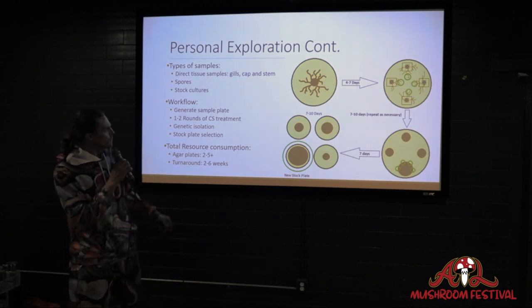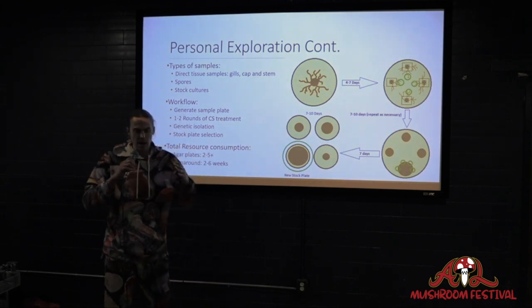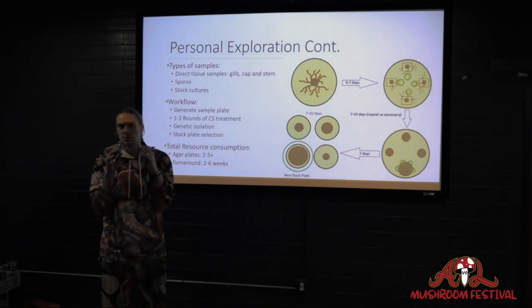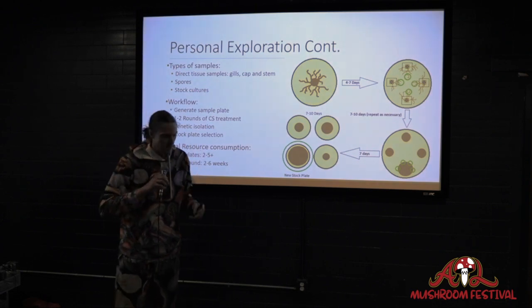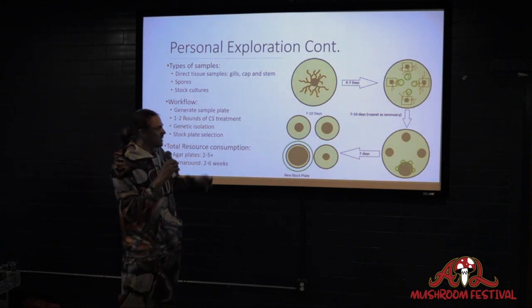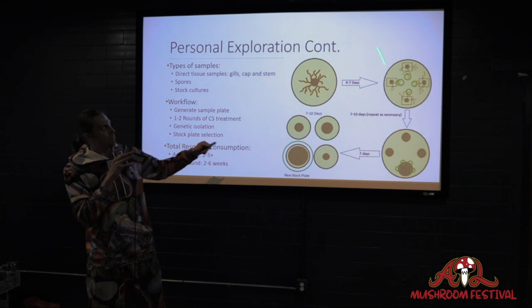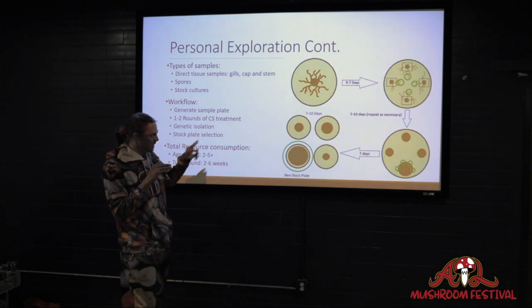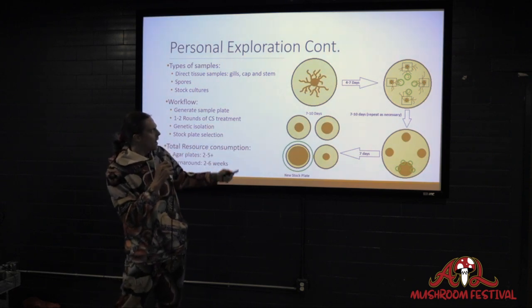So if you put the culture, like a little sample, directly into that cabin, what happens is that cabin eats up all the oxygen in the first day. And then after that, it's just sitting in this high CO2 environment, and it takes a really, really, really long time to grow out of it. So, 2, 3, 4 weeks. So what I found is that essentially, quote unquote, germinating it, getting it to start producing that secondary mycelia on a plate first, and then putting it into the cabin gets me superior results, and I'm able to basically cut my time in half.